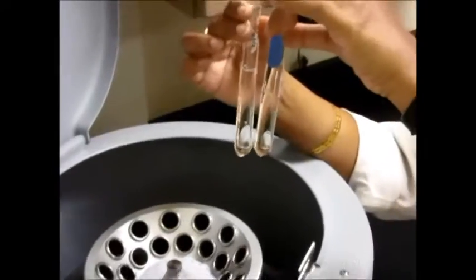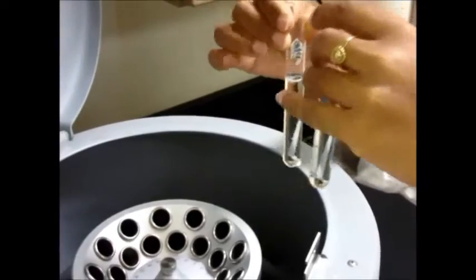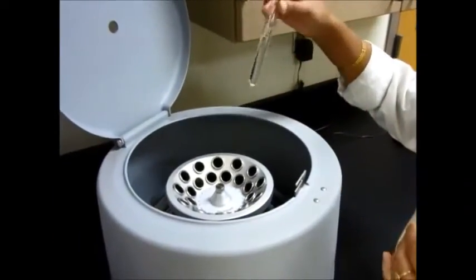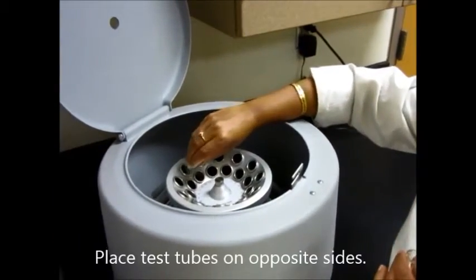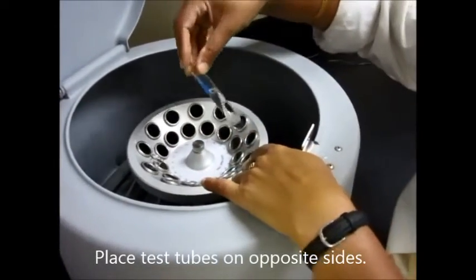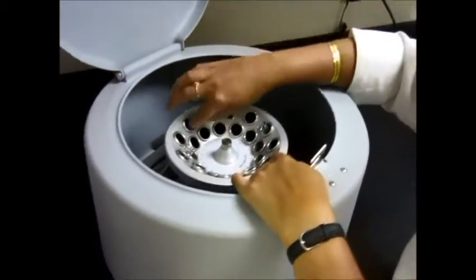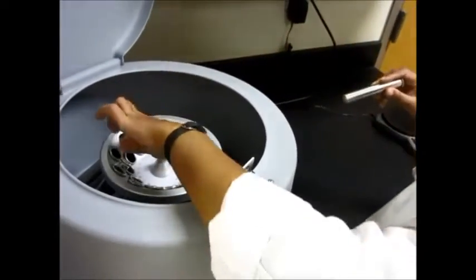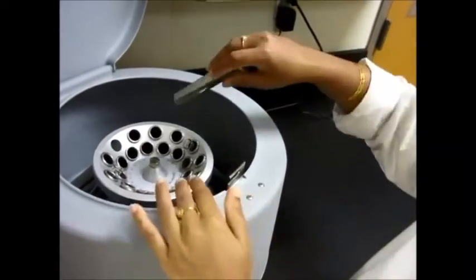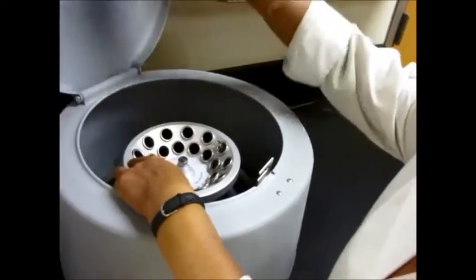My two test tubes are now equal in amount, and that's how they should be. When putting anything inside the centrifuge, they should be equal in volume so that when you spin them they don't have unequal force. Go ahead and put your test tubes on absolutely opposite sides — one over here and then one on this side to balance the centrifuge. Remember, do not put your test tube in a plain hole — that will lead to breakage.